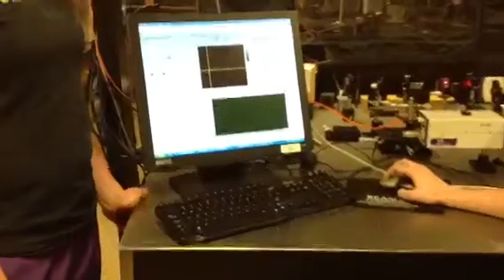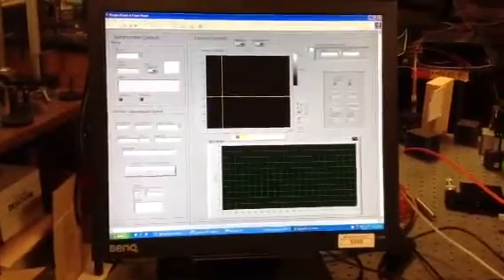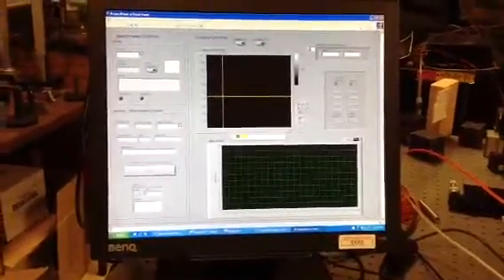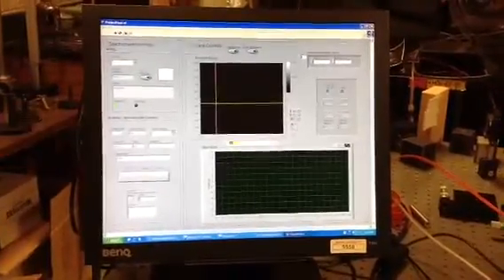So we can start out first by initializing the spectrometer. We want to connect it to LabVIEW. So we do that by first running continuously. And then we can connect it. You can see that it is initialized.